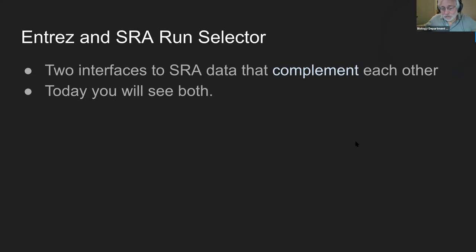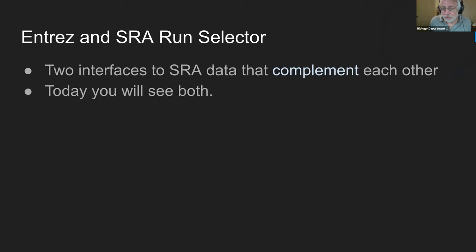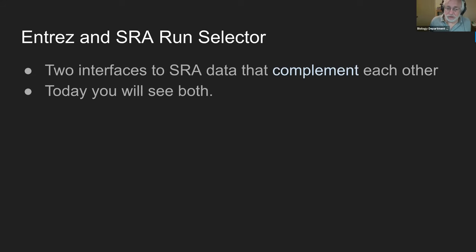Today we're going to spend our time in SRA in two things: Entrez and the SRA Run Selector. Entrez is a query interface used across many NCBI resources, so you may already be familiar with it. The SRA Run Selector is a newer method of interacting with SRA data. They complement each other — they don't replace each other.